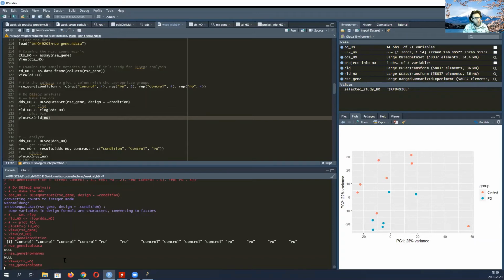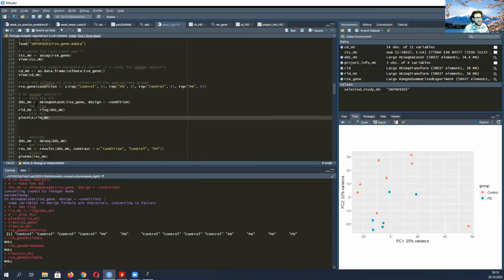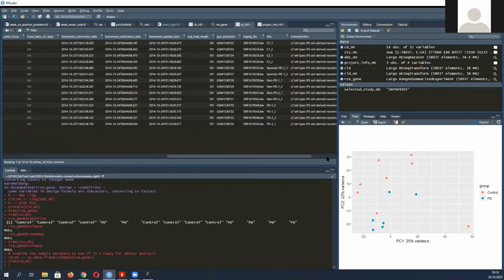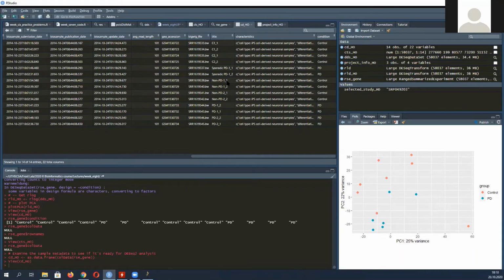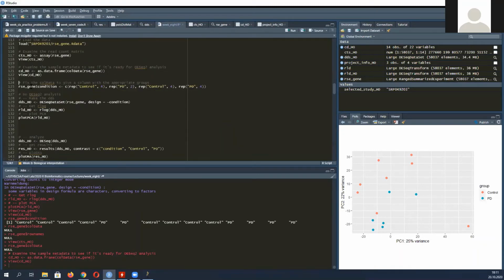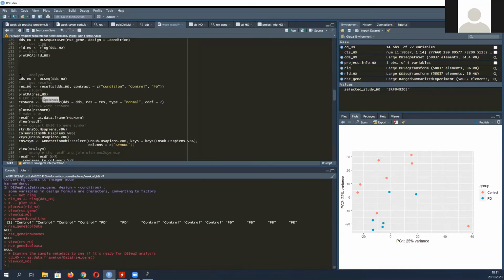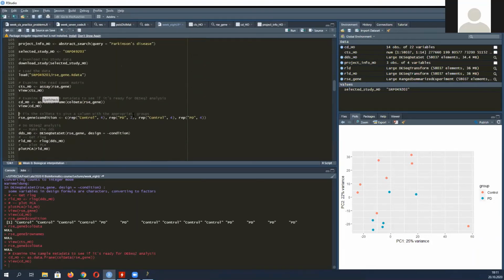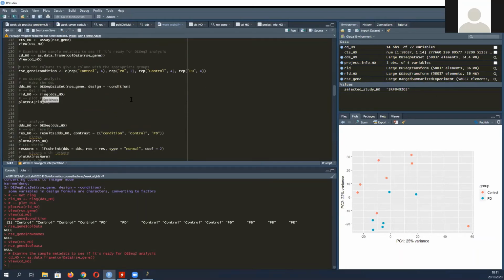Sure. Well, run lines 121 and 122 again, because that's going to show you your updated column data. Oh, so I'm just an idiot and didn't do that. Okay, no, that did work. You did have it right. Okay, good. I was just like, why can I not find it, I thought it was supposed to be in the column data now, but I just didn't run it again. Okay. Well, then I would honestly just put HO at the end of everything in your code and see if you need to change other stuff, because that's how I did it to get it done quicker. I didn't start from scratch and start typing, because that would have taken way longer.